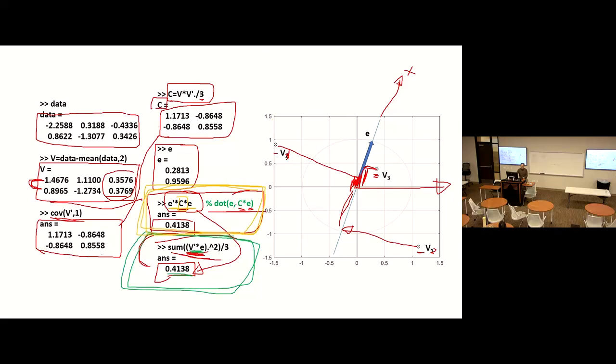So we need to find an E that gives you the largest variance. This E I just arbitrarily found randomly, by a combination of two numbers. But you can try many different ones.